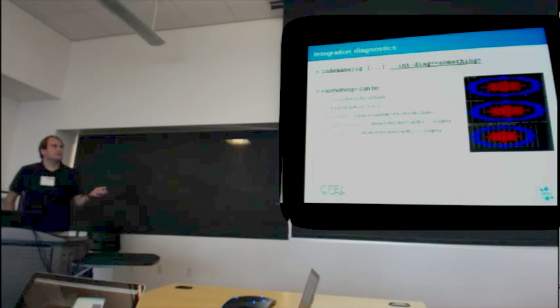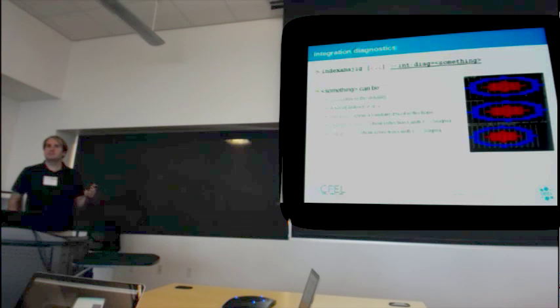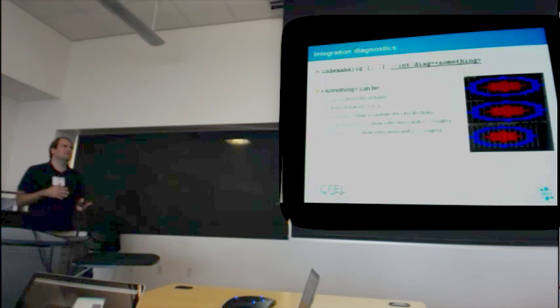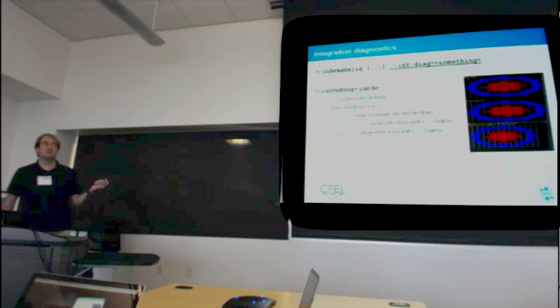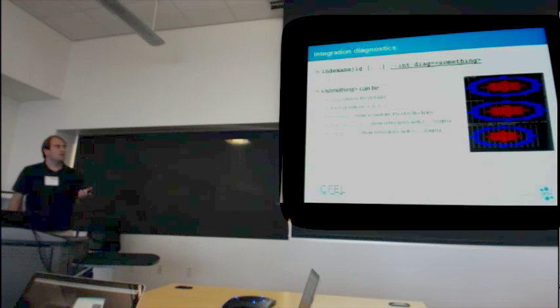A good use of this is if you choose the implausible option, this will show reflections which have intensities less than -5 sigma. So ones that are really negative, more than they should be. -5 sigma should basically never happen. So if you see this, this is implausible. In fact, CrystFEL by default will reject reflections that are negative and more than 5 sigma. It will print a warning. So if you see this warning popping up, you should do int diag equals implausible and look.